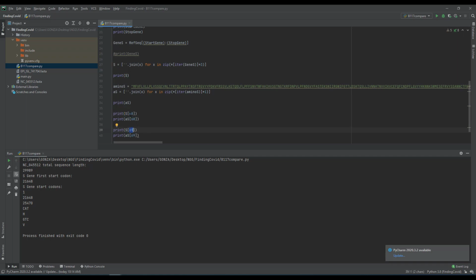The reason why we're going to do 68 and 69 is because in computer language they don't start with 1 like we do in this numbering for the H69V70. The first amino acid is listed as number 1, but in computer code they start with 0.